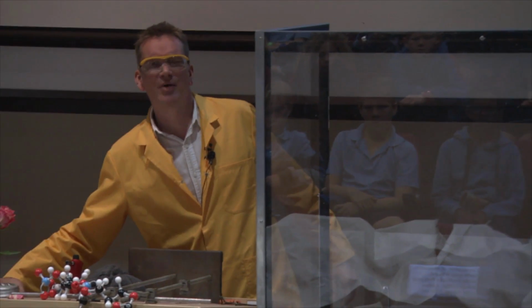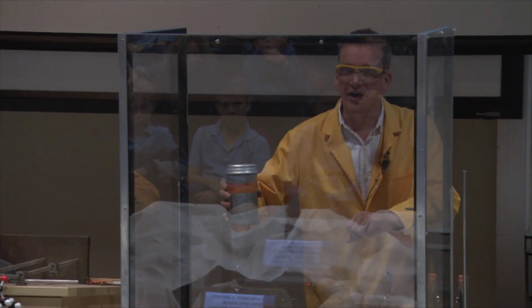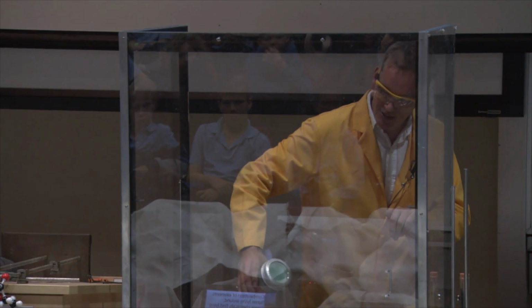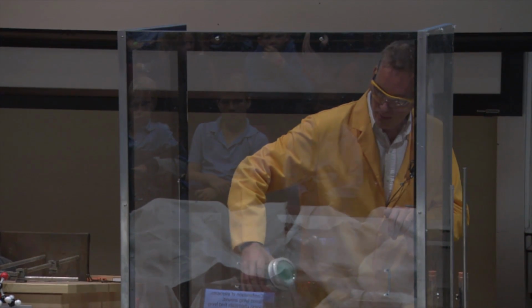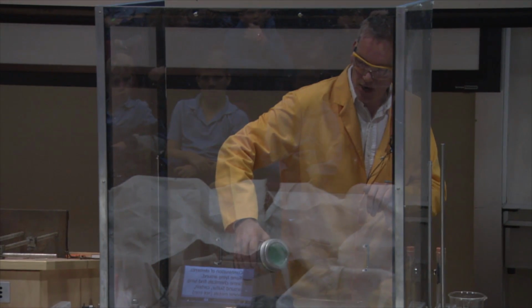I'm going to add to this some oxygen. Well, of course, there's oxygen all around us in the air that we breathe, but this is liquefied oxygen. So oxygen is normally a gas, but here we've cooled it down to make it into a more concentrated form. So I'm just pouring this very, very cold liquid oxygen onto the iron wool here, and it's instantly turning back into the gas, but it's just ensuring that there's lots of oxygen vapor, lots of oxygen gas around our wool here. Now, if we just have the lights down, I'm just going to apply a light and see what happens.